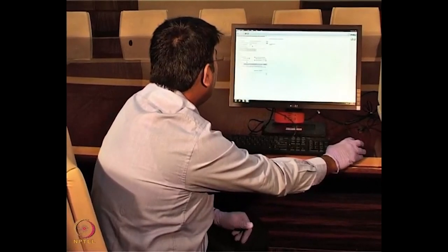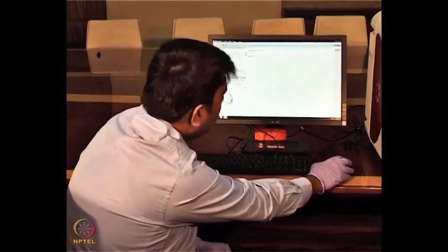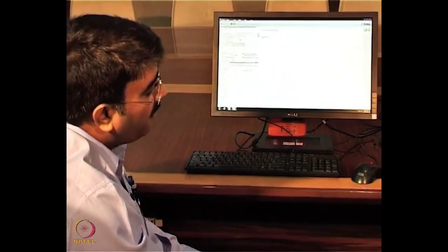The second option is whether, during the hydration, your sample has to be under shaking conditions, because the instrument has a shaker, which will effectively mix.